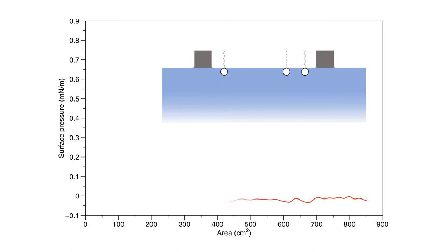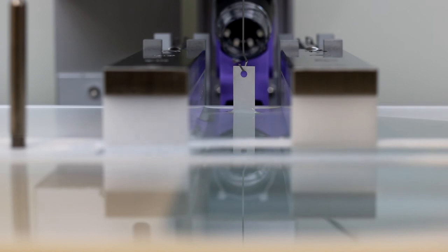However, as we have discovered here, the surface pressure did increase. This results from us confining contaminant molecules and particles that are already floating at the air-water interface. With the barriers fully closed, we can suck up these contaminants.